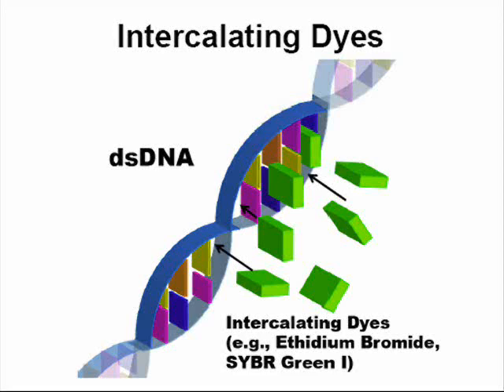This next slide shows a diagram of DNA detection or recognition using intercalating dyes. These dyes, such as ethidium bromide and SYBR Green I, have high affinity for double-stranded DNA. They prefer to intercalate between the base pairs, as shown here. These are commonly used in gel electrophoresis, but also rather common in some types of pathogen recognition tests where you know what you are amplifying in the reaction vial.